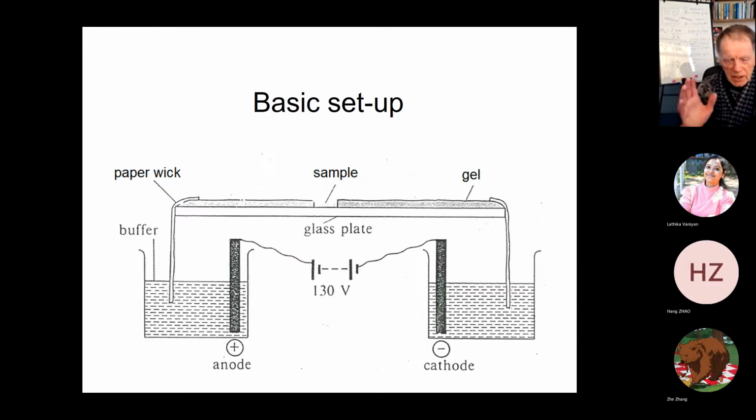And this isn't an SDS-PAGE setup. This is just a basic electrophoresis setup taken from the Firth and Moore book, just to illustrate the general principles of electrophoresis.